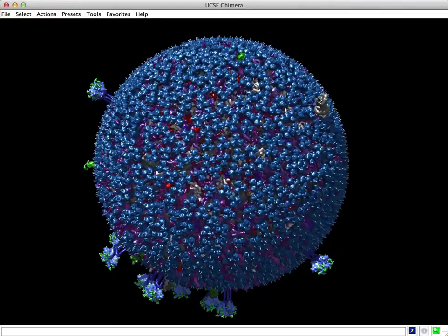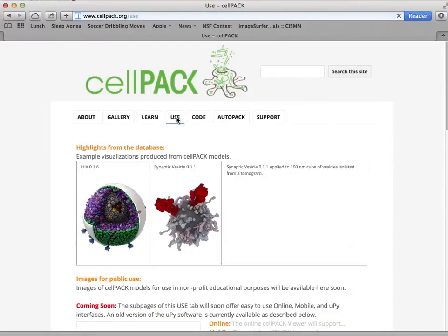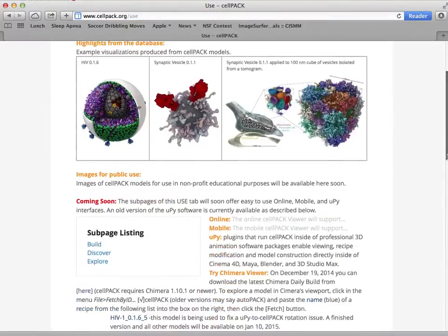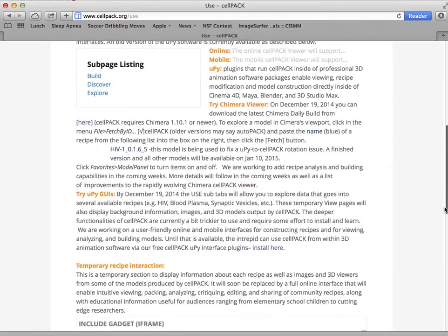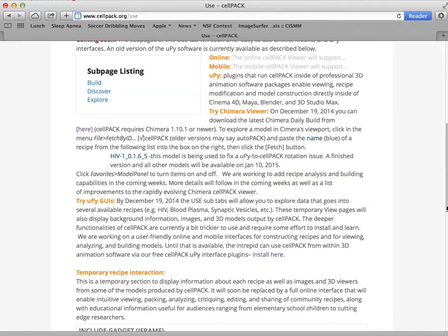I'm going to quit the software and go to our Cellpack website to explain how you can set up and find instructions.